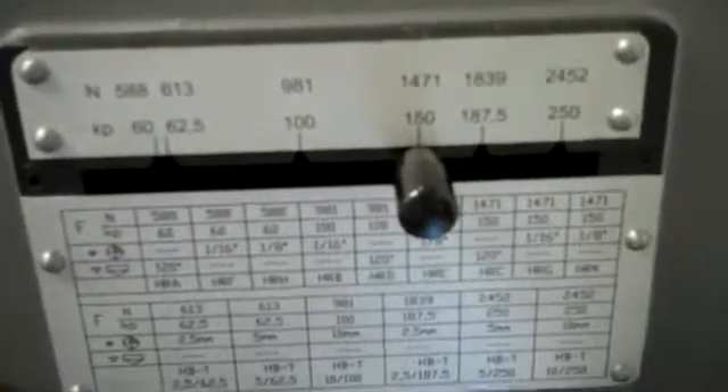First, we're going to show you the clamping mechanism. We have a clamping shield here which is going to take the load of the part. As you can see, the diamond or penetrator will not be making contact with the part until the load and the pressure is taken onto the clamping shield.